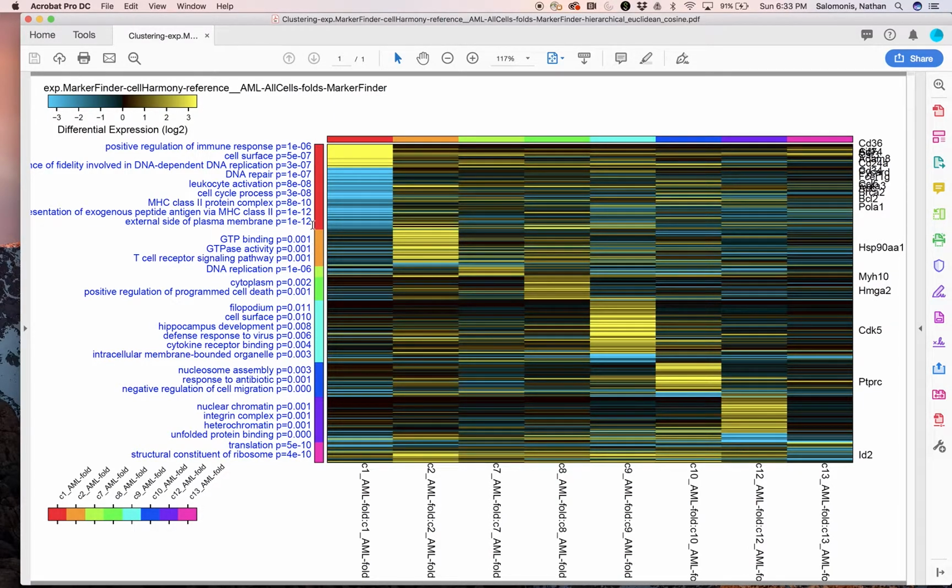And for this cluster of genes, you can see the pathways that are most statistically enriched based on a gene ontology enrichment analysis. The most significant term within this cluster was external side of plasma membrane genes, along with MHC class II complex. So you can see, importantly, that within each of these different cell states within the AML, a different set of genes are either upregulated or downregulated, with most of these cell states indicating more genes upregulated than downregulated within the AML tumor.